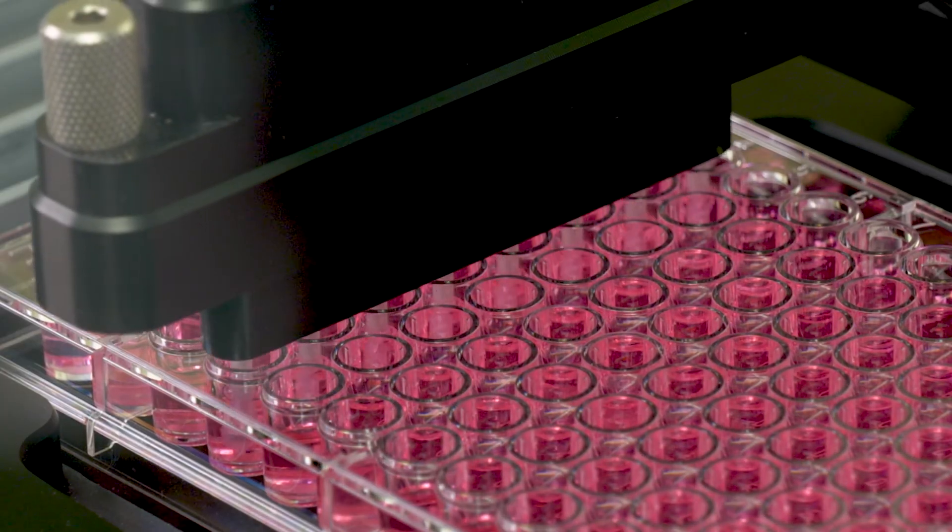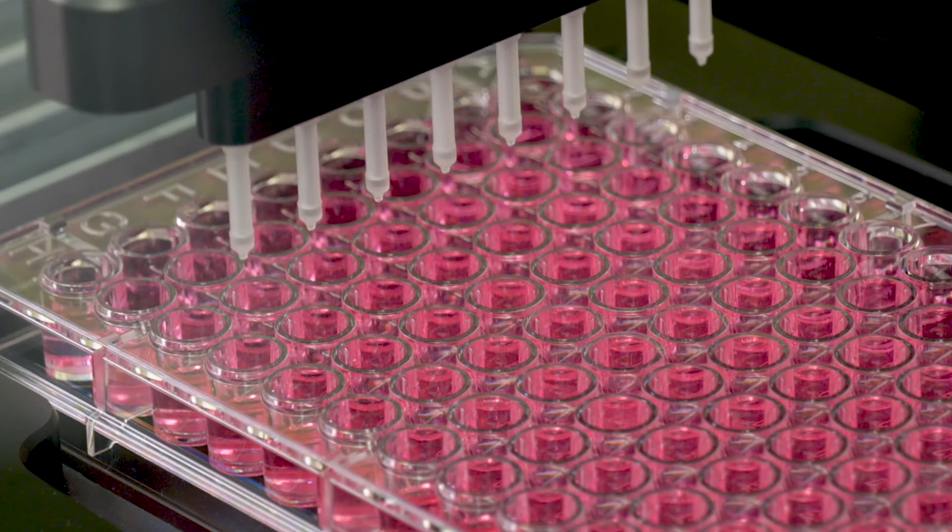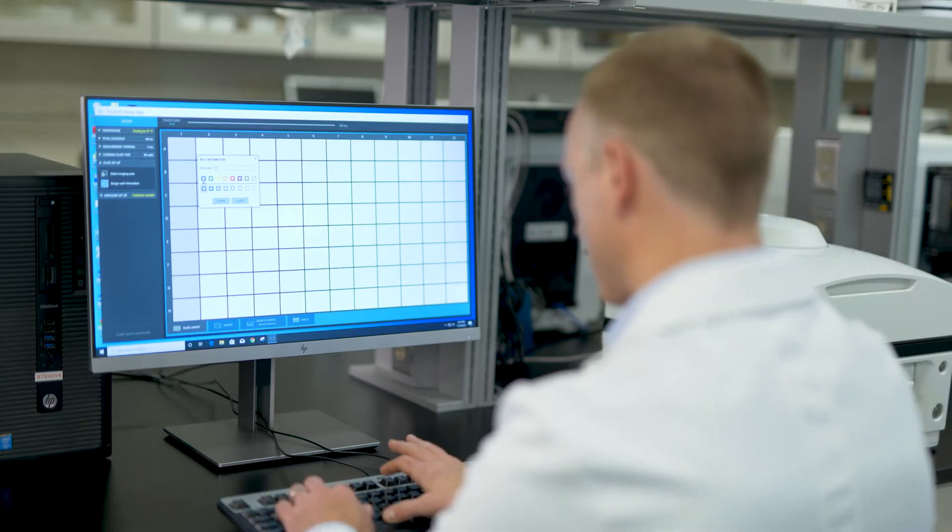The auto-scratch wound making tool and the Scratch Assay app provides a simple, straightforward way to automatically create uniform, reproducible wounds in 96 and 24 well microplates. The Scratch Assay app automates capture and analysis of kinetic images and generates detailed quantitative profiles of cell migration. The result is better data and higher throughput.